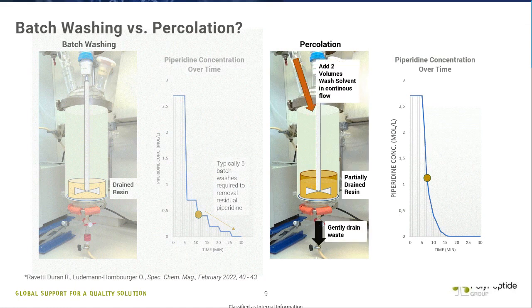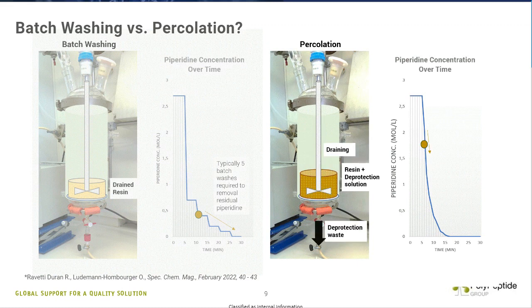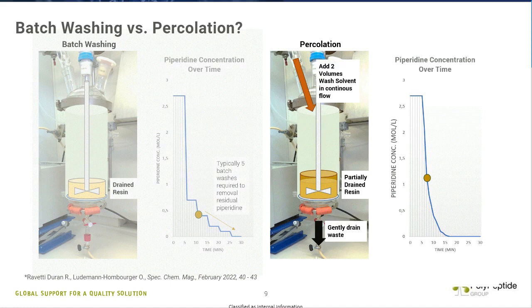In this case, we saw that for our demonstration batch, when we had an amino acid coupling that was complete but had to be left overnight for one reason or another, this is when we saw the formation of endo impurities. So in this case, we increased the wash procedure, and this eliminated our endo-ala impurity essentially.